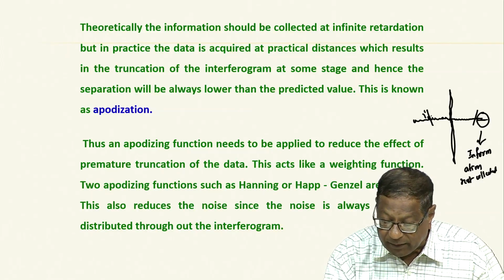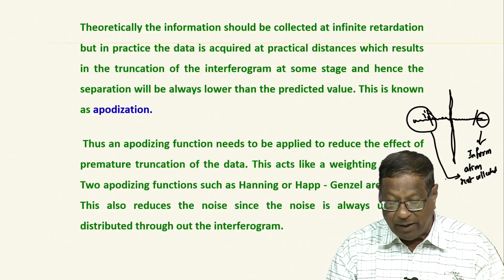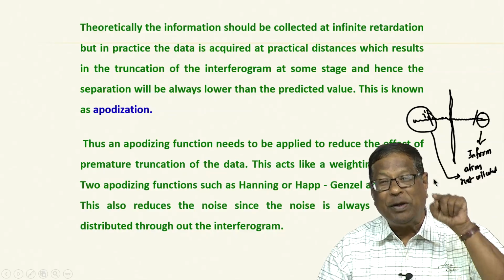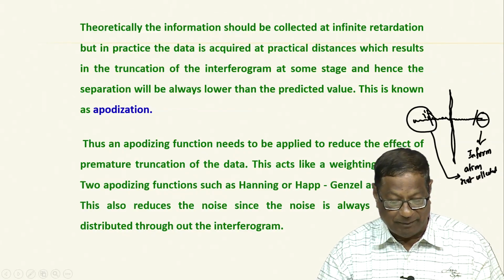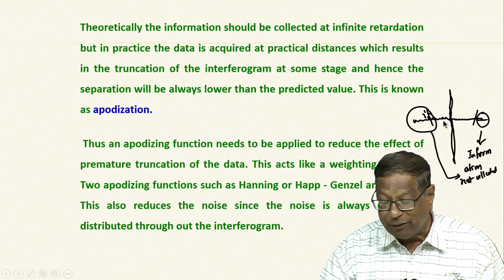Same thing is here. That means I am truncating the Fourier transform from infinite to a particular finite position. So, this results in the truncation of the information.